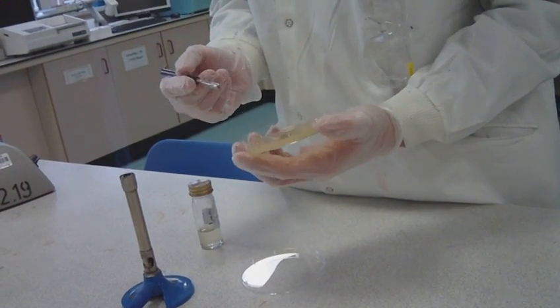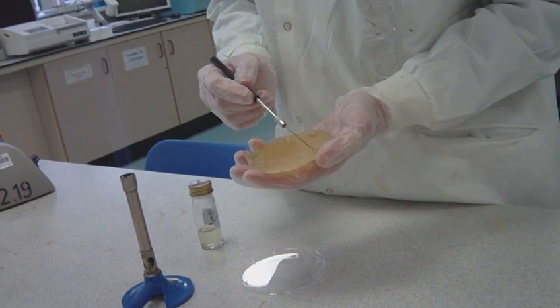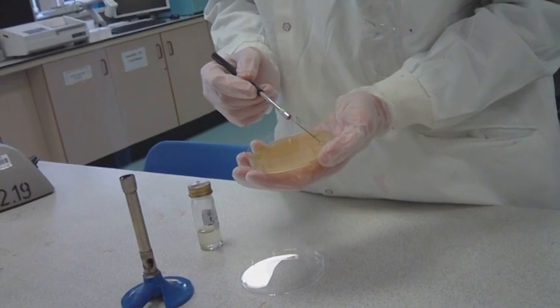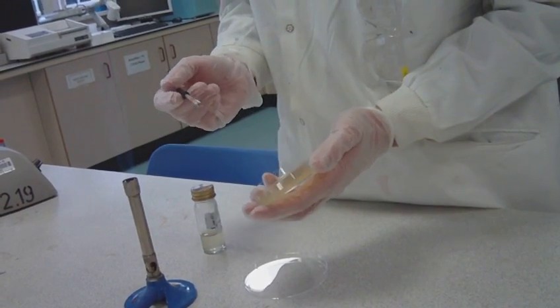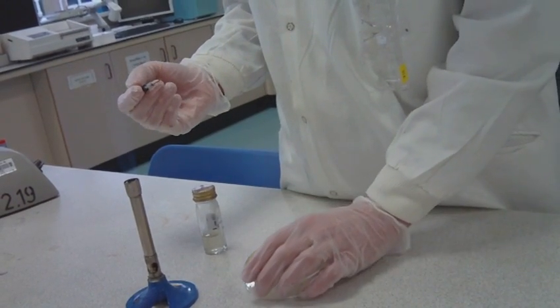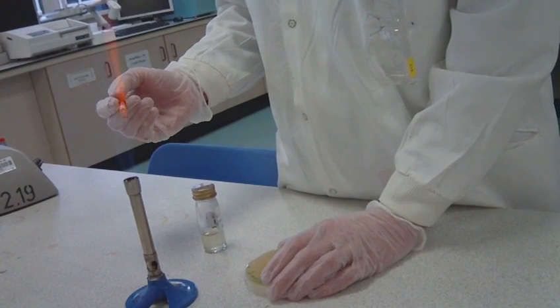Using the loop, streak the bacteria across the first quarter of the agar from the circle you just made in three to four lines going from 12 to 3 o'clock. Remove the loop and close the petri dish.